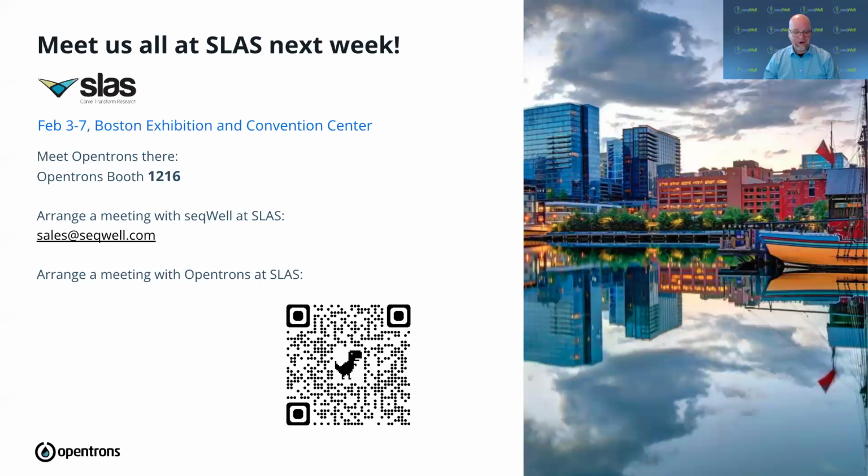So, for that one, you can do in either fashion. And the throughput will obviously be a little bit quicker, a little bit more efficient using an automated system. For the 384-well ExpressPlex HT, we would never recommend trying to do that by hand. That is a recipe for disaster, regardless of what chemistry you're trying to work with. So, a situation like that absolutely requires an automation platform.